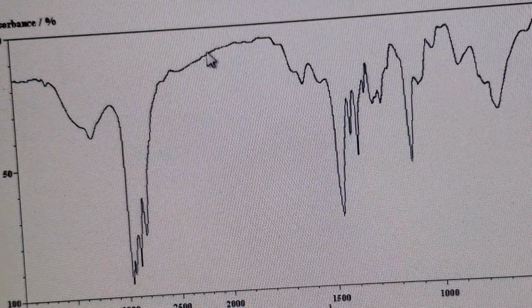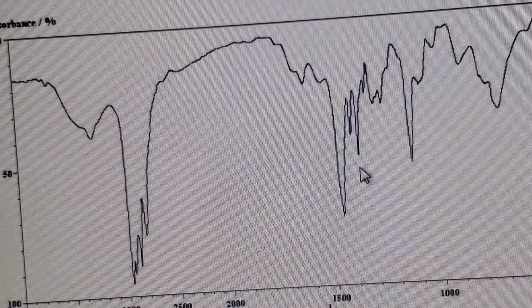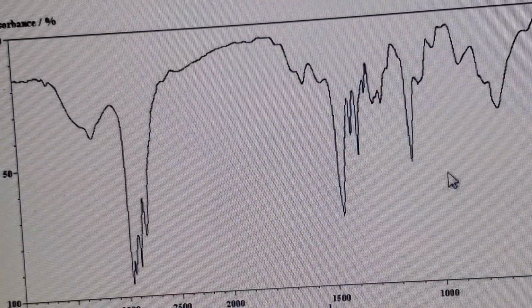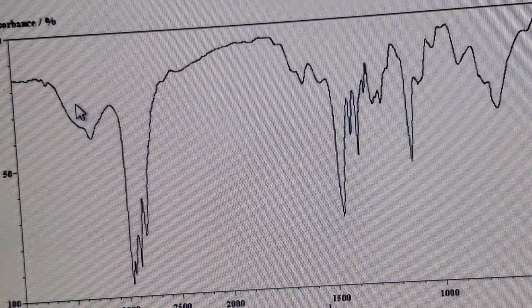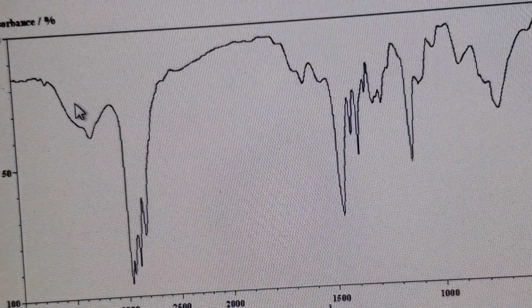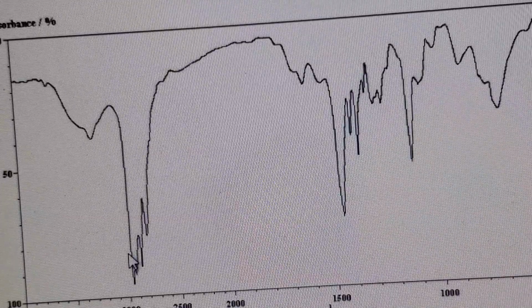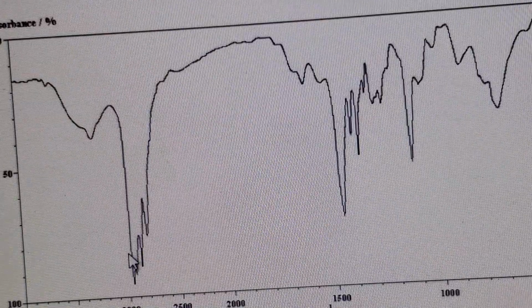2200 ish, and no carbonyl group, but you have some bending vibrations, but I don't want to bet on anything, because that's just somewhat polar bending vibrations due to the nitrogen presence. So I just want to confirm, only based on this IR at the sophomore level, this would be just a secondary amine with a bunch of alkyl chains. So this actually is two propyl groups on the secondary amine, so dipropylamine.